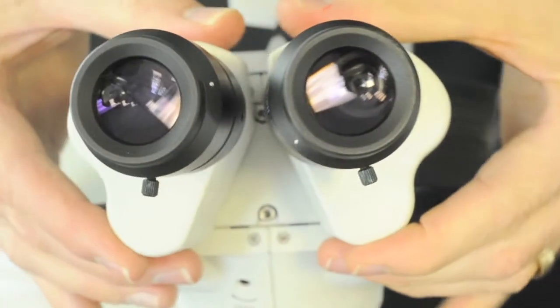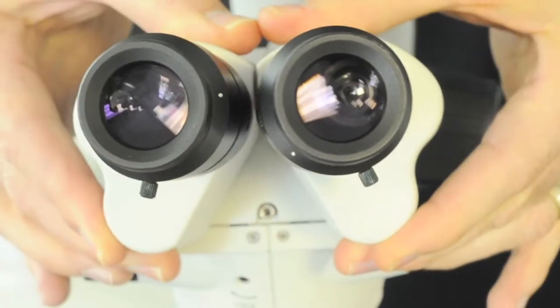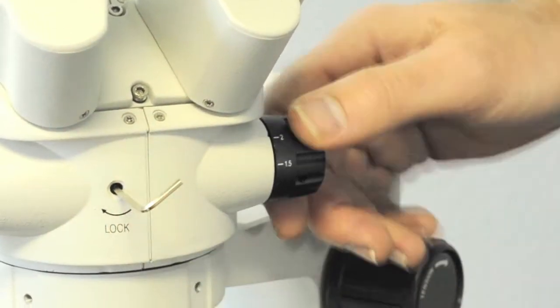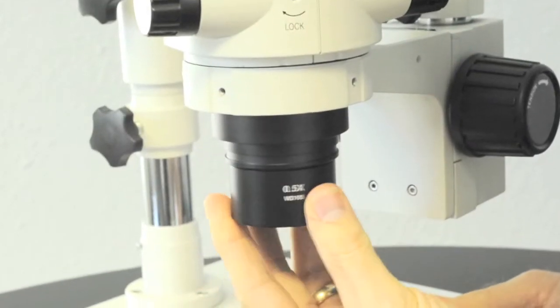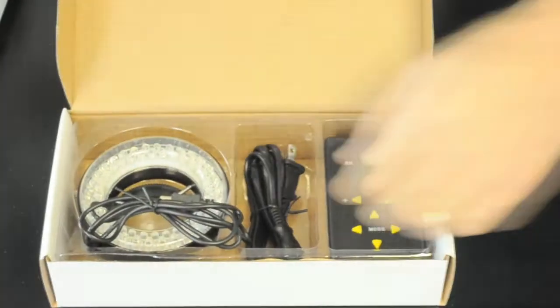The stereo head provides a clear bright view with 7x to 45x magnification and can be locked at a specific zoom point using the locking feature as shown. The included .5x barlow lens can be attached to provide extra working distance.